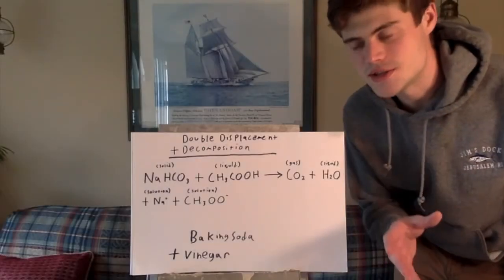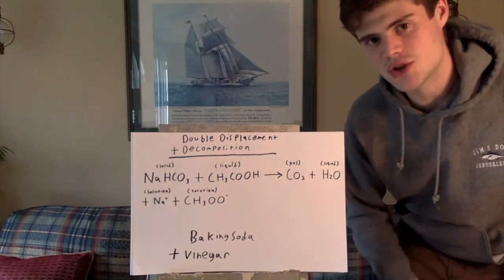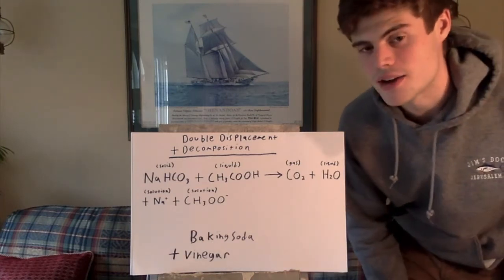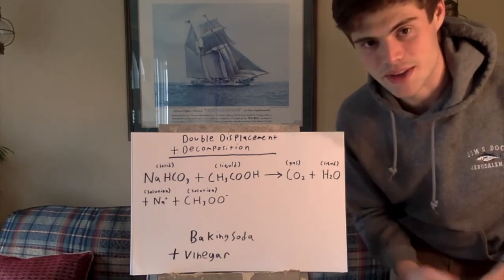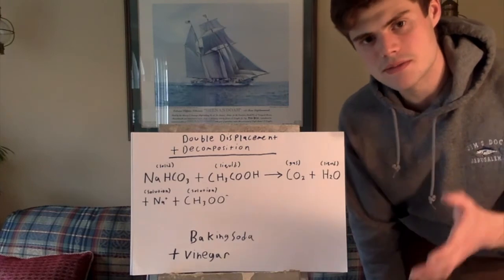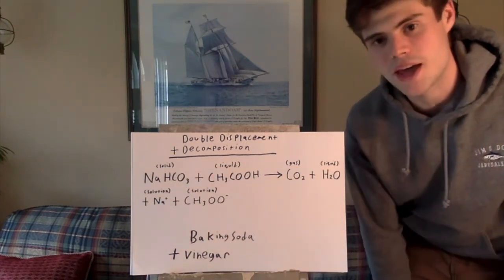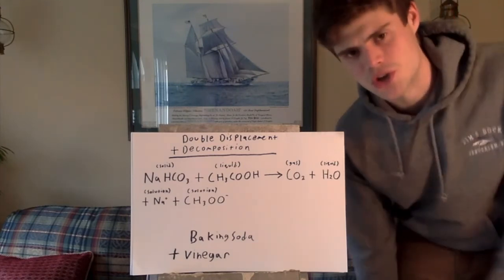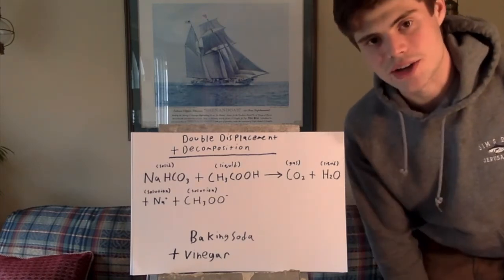So today we did 2 experiments where we isolated hydrogen. We pulled hydrogen out of the places that we can find it in our natural environment here, whether it be from water or from something like a hydrochloric acid. But there are other experiments similar to these that you can do at home. In fact, ones that are even more complicated when you look at them from the chemical side of things, when you really start to look at how those molecules and elements are changing in a reaction.